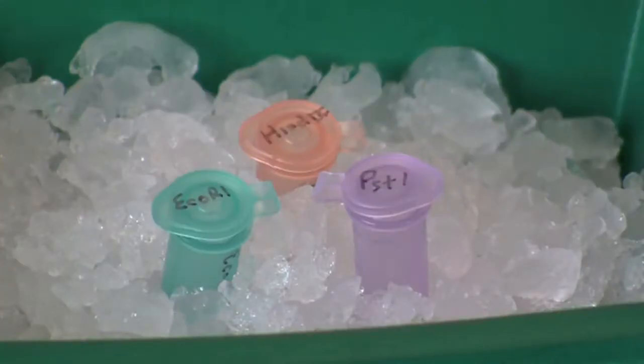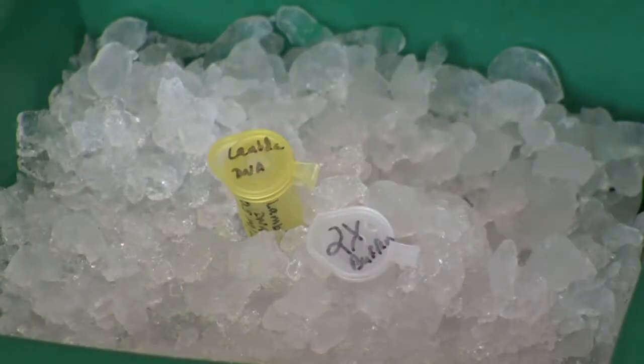For this activity, you will need samples of ECO-R1, HINDI-3, and PST1 restriction enzymes in microcentrifuge tubes on ice. You will also need samples of lambda DNA and 2X restriction buffer on ice. It is helpful to use color-coded tubes to organize and keep track of samples in this activity.